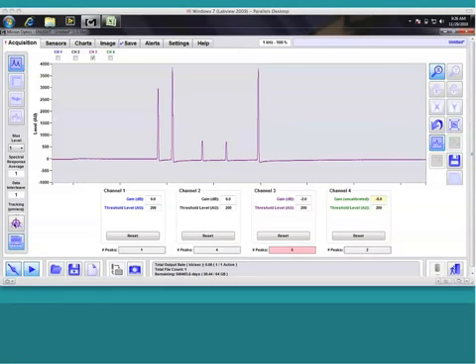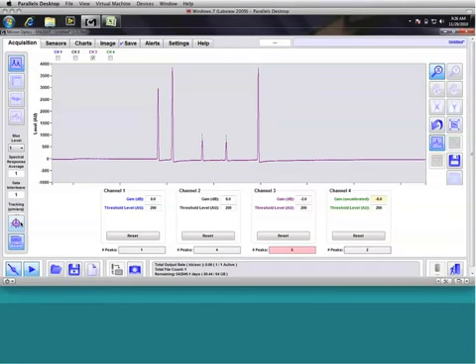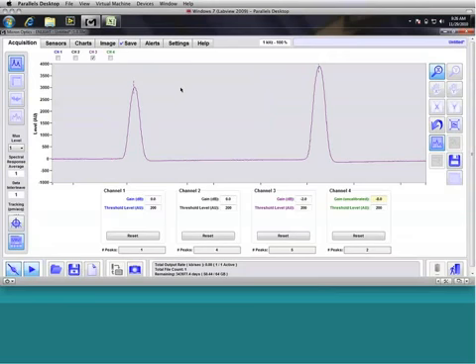We're going to click on the reset wavelengths tracking, and a couple things will happen. First, the background goes from this light red to a gray, and you'll also notice that we have dashed lines on all 5 of those sensors. And so now ENLIGHT and the SM130 are in agreement and synchronized on how many spectral peaks are supposed to be detected.